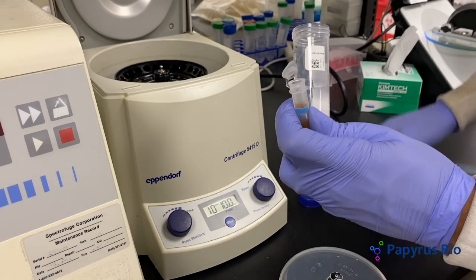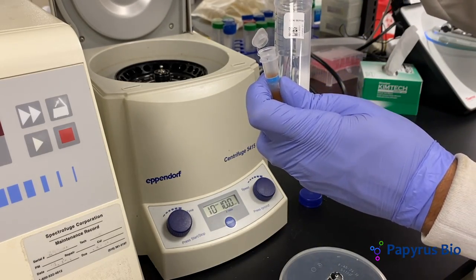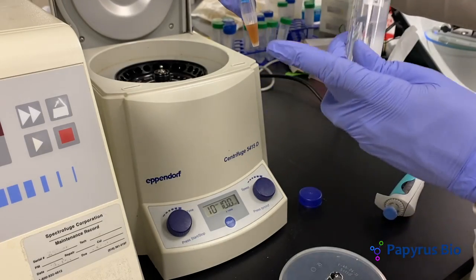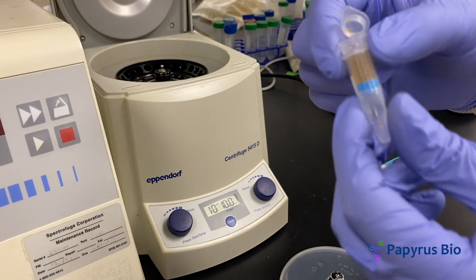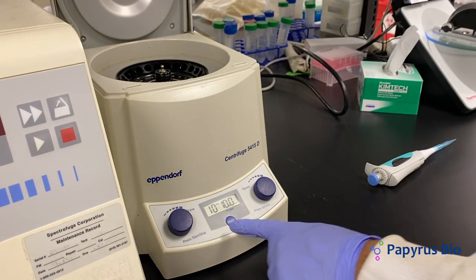Next, add more conjugation buffer to the top of the filter tube. Discard the filtrate and keep the retentate. After the filtrate has been discarded, the solution can be centrifuged again. Repeat the buffer exchange at least two more times.